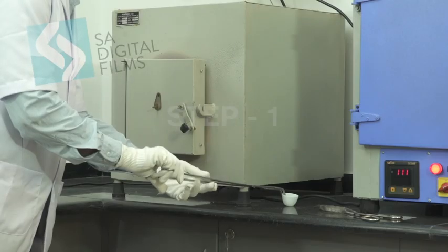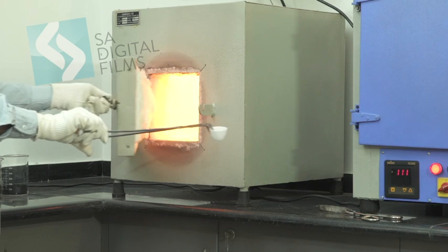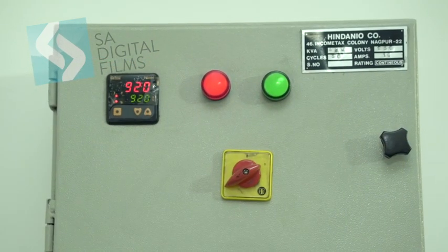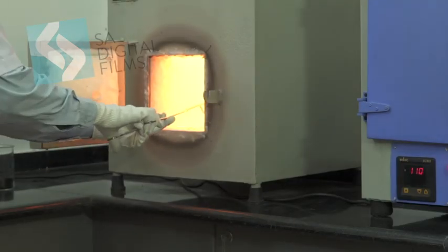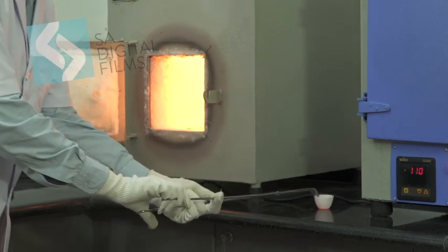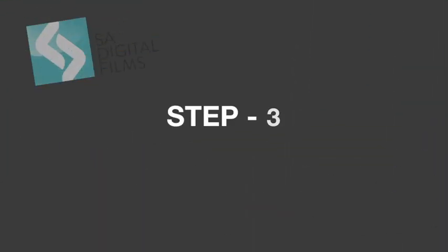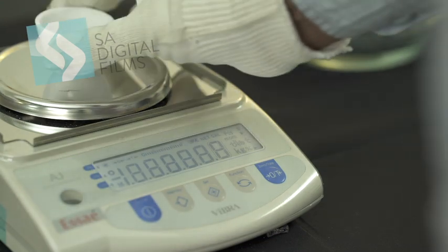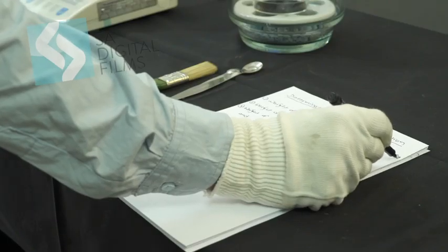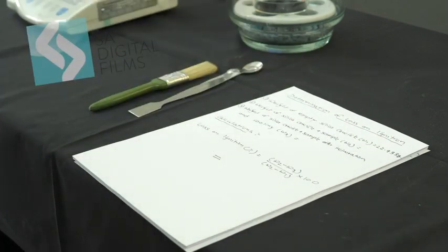Step 1. Pre-ignite the silica crucible in the muffle furnace maintained at 920 degrees Celsius for 15 minutes. Step 2. Remove the crucible from the furnace using a tong and let it cool for 15 minutes at room temperature. Step 3. Place the empty silica crucible on the weighing balance. Note down the empty weight of the silica crucible and denote it as W1.